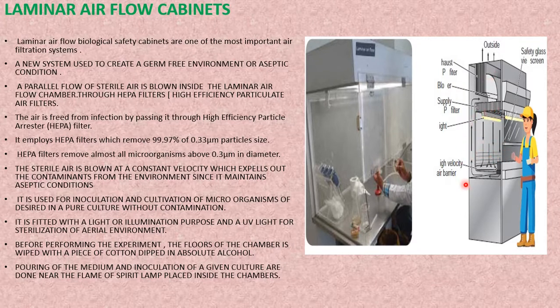So this is how the laminar airflow works. Let's see in detail. Laminar airflow biological safety cabinets are one of the most important air filtration systems. In a microbiology laboratory, we cannot sterilize the whole room, isn't it? It is a very big task to do that.